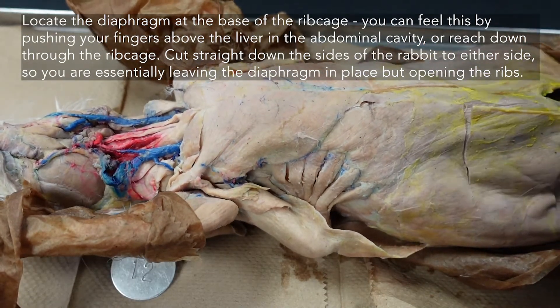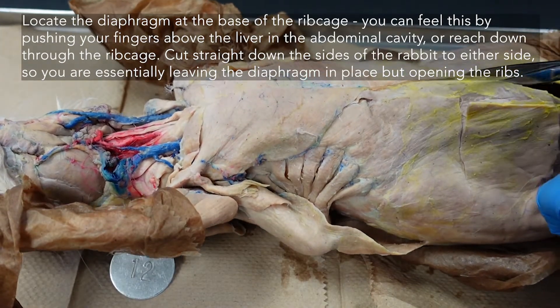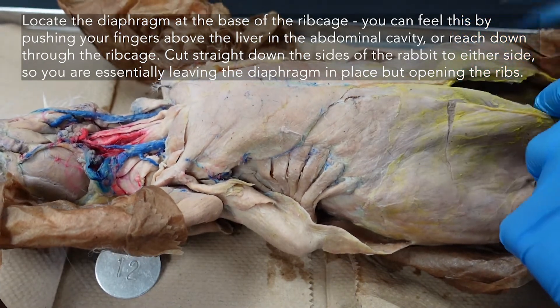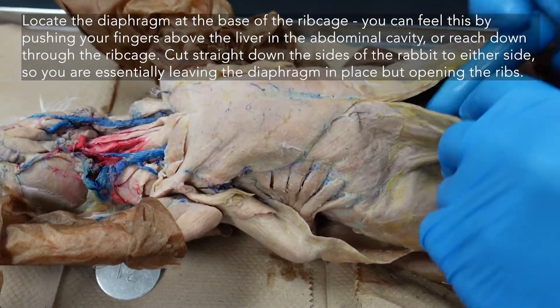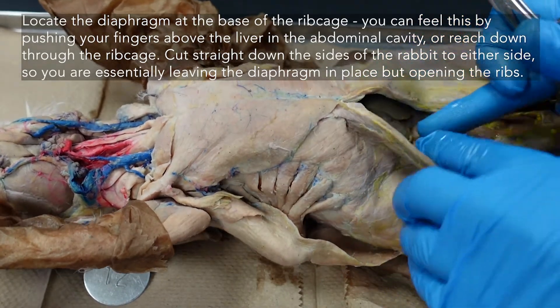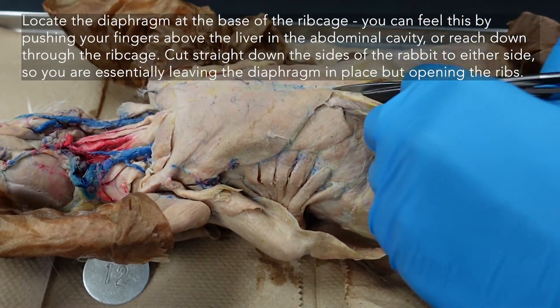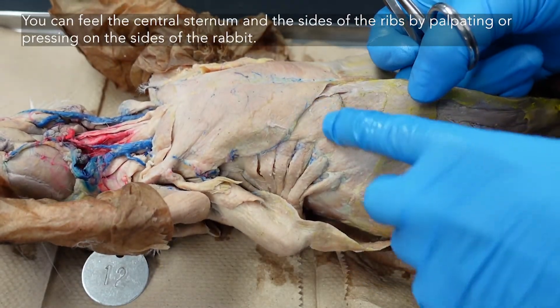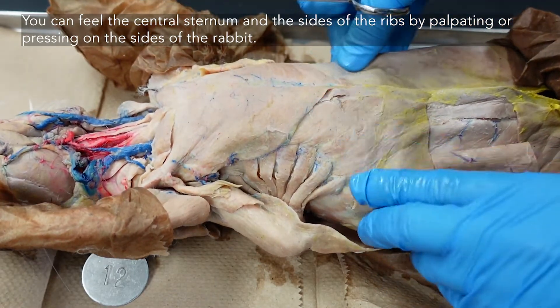To open up, we already have an opening in the abdominal cavity. Extend that opening all the way up so you can reach forward and feel how far you are going. You're going to start to expose the liver, and the diaphragm is sitting above the liver. You can also feel where the ribs are — palpate and feel the ribcage arcing down on either side.